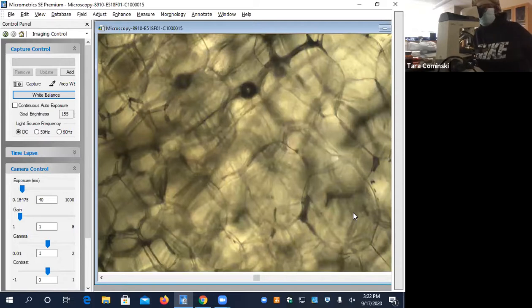And if we were going to do cheek cells, the cheek cells are a lot different shapes. They're more irregularly shaped, round, and more spaced out. But same thing, you can see the nuclei. If I showed you a picture like this when I give you a lab practical, you should be able to identify the nucleus, and know that these are cheek cells and these are onion cells. If we did our slide of the cheek cells, we would be able to see that.